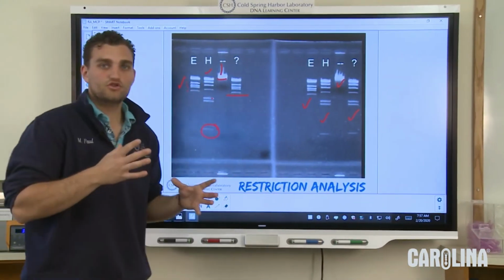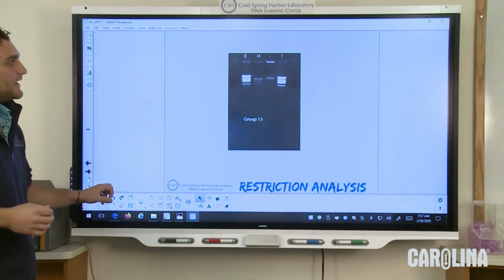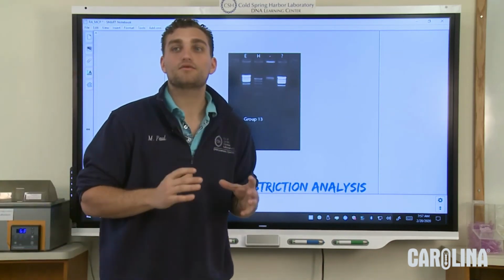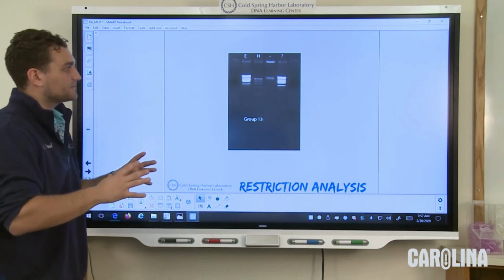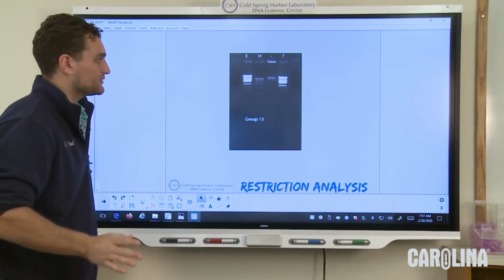What I want to do is show you what a student gel looks like sometimes. So let's go all the way to the end. And this is an example from a class that I have recently taught, right down the road at Harbor Fields High School, right down the road from Cold Spring Harbor.